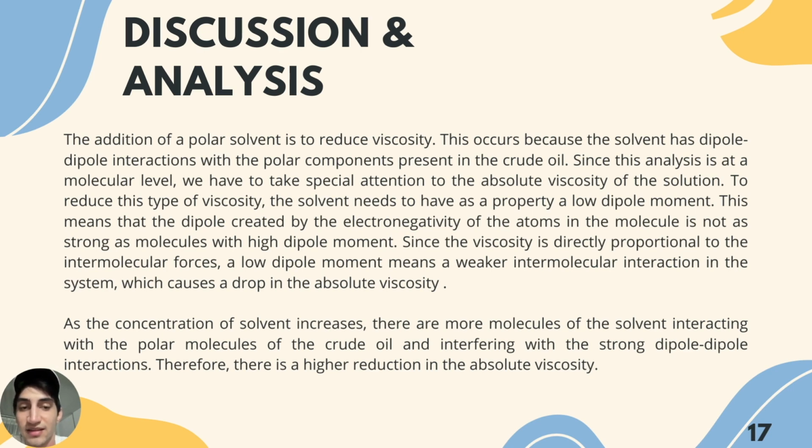Since the viscosity is directly proportional to the intermolecular forces, when there is a low dipole moment solvent, this means that there is a weaker intermolecular interaction, which can cause a drop in the absolute viscosity.